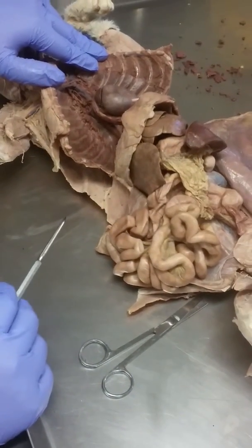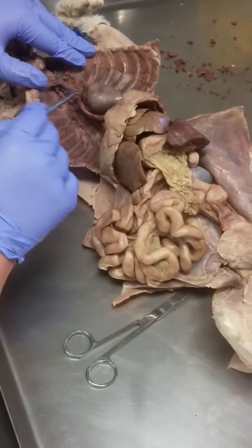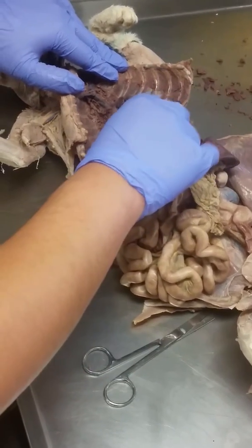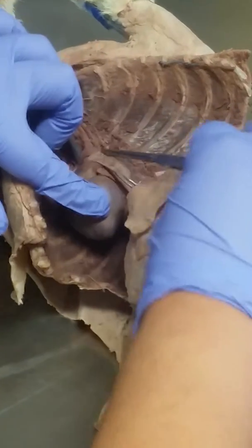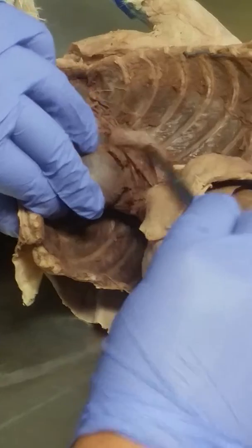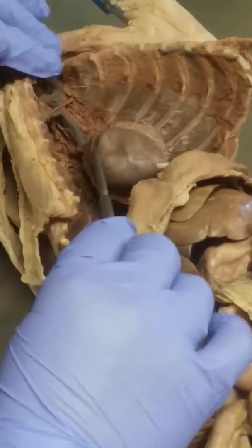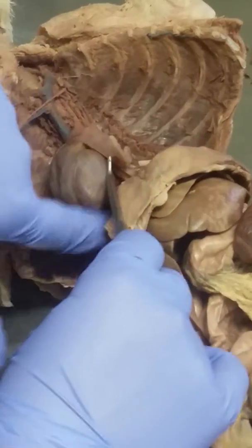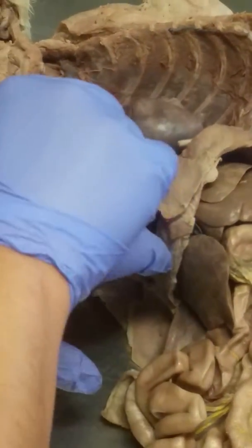We just went over this 20 minutes ago. No. This is the right auricle. The right atrium is going to sit underneath the right auricle. So this is the right auricle. If I move it this way, notice there's the left auricle. Left auricle, right auricle, right? Which means that the right ventricle is over here, and the left ventricle is on this side. There's the apex, there's the base.